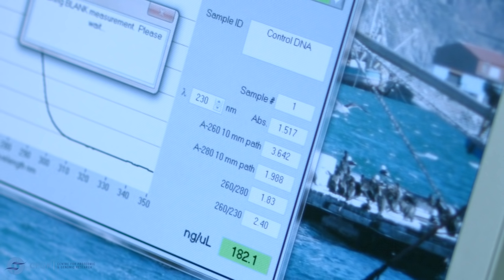When all the DNA plates are completely dried down, seal the plate with a PCR plate seal, ensuring that all wells are completely airtight. This can be achieved by using a seal applicator. Close the plate. Each plate has a lid. And place the DNA stable plate into a shipping bag.